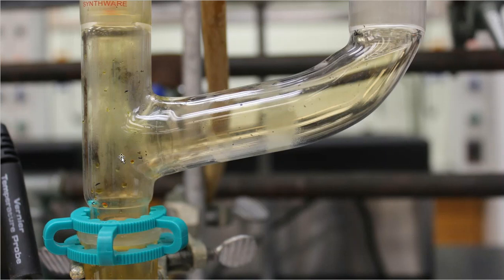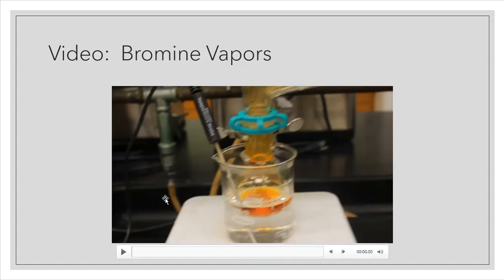So as the vapors go up into the Claisen, it's going to hit the separatory funnel that has the joint addition. That's why we had to use a joint on the separatory funnel. We need it closed off. All right, so there's nowhere for it to go there. Then it's going to divert itself, and it's going to go up through this part of the Claisen adapter, and it's going to hit the reflux. And at the reflux, it will condense back down to a liquid and drop back down into my boiling flask.